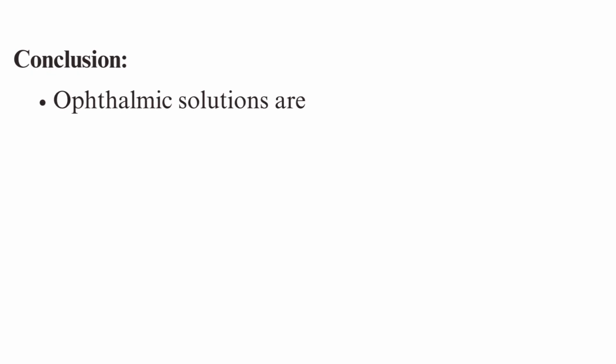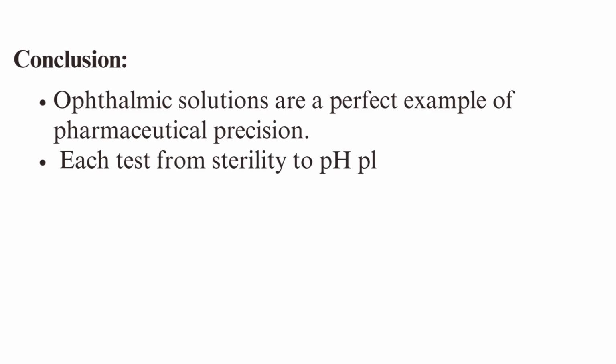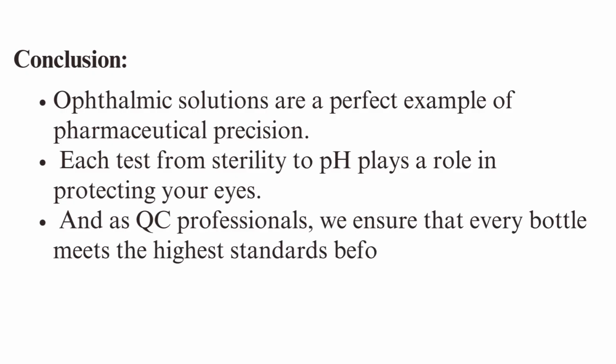Conclusion. Ophthalmic solutions are a perfect example of pharmaceutical precision. Each test from sterility to pH plays a role in protecting your eyes, and as QC professionals, we ensure that every bottle meets the highest standards before it ever reaches the patient.